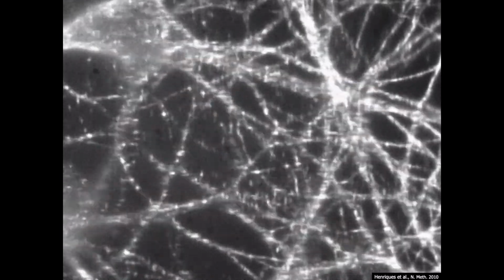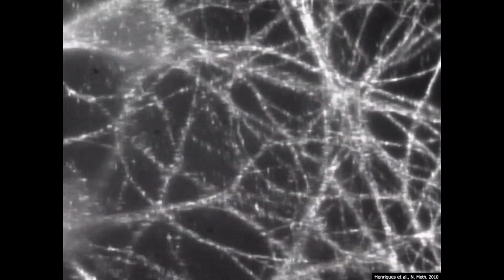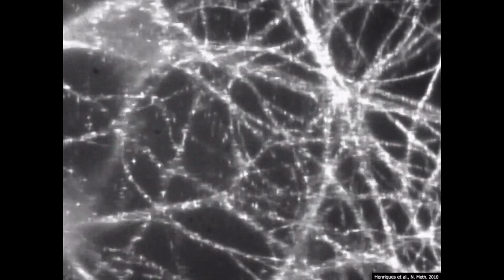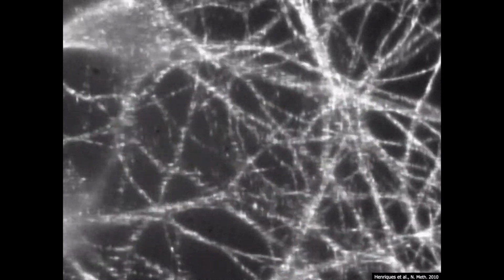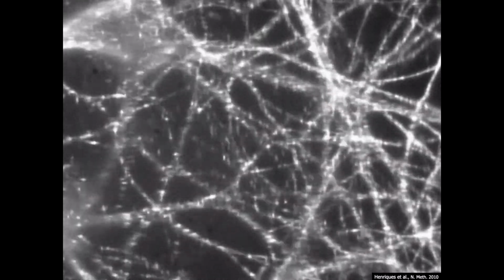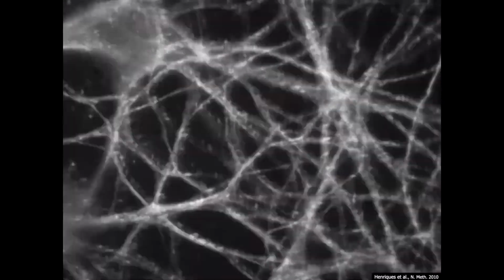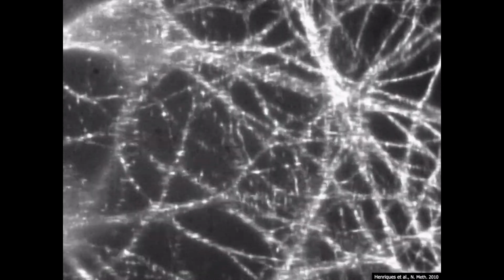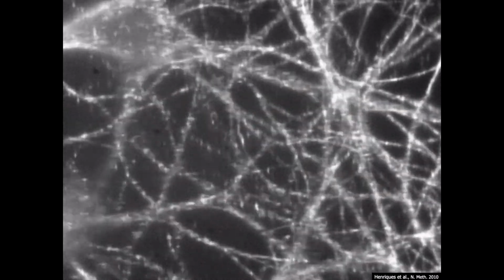So what you're seeing here is a typical single molecule localization microscopy dataset. In this case, a STORM dataset. And it's very similar to what you want to get on a microscope, because you see individual molecules blinking there, which means that you can use a filter to localize those individual molecules. But the problem with this also is that you're spreading information over a large amount of time. You're pretty much needing to acquire about 10,000 to 100,000 frames to actually recapitulate most of the molecules that exist in the sample that might then blink during that time.